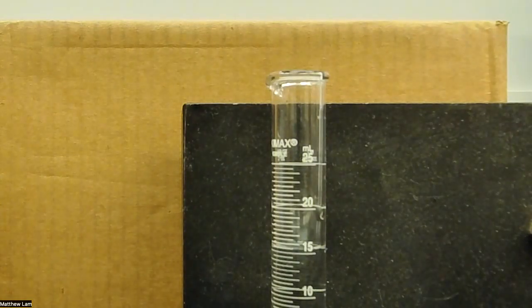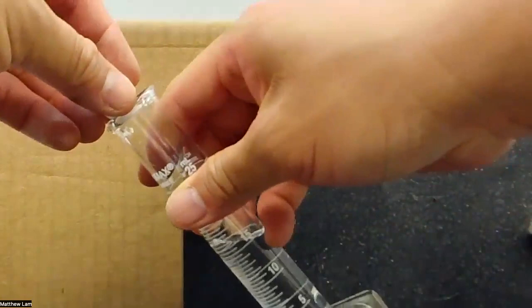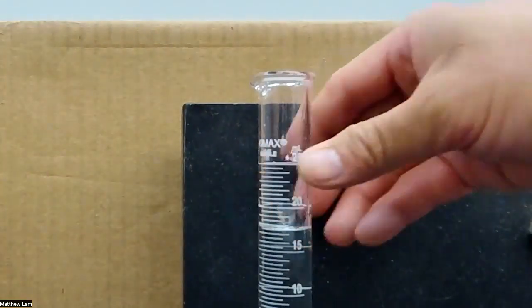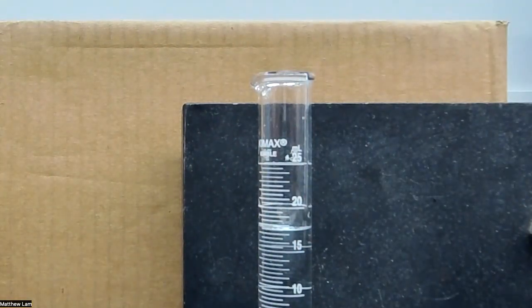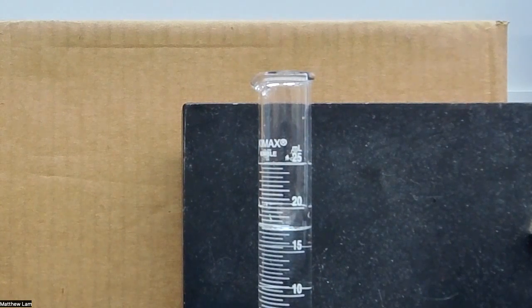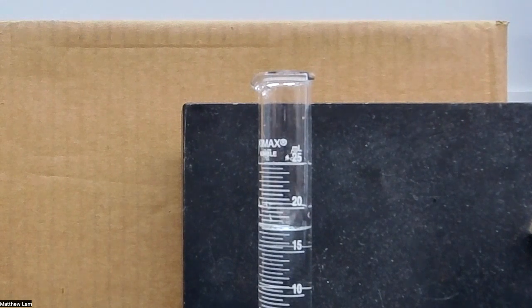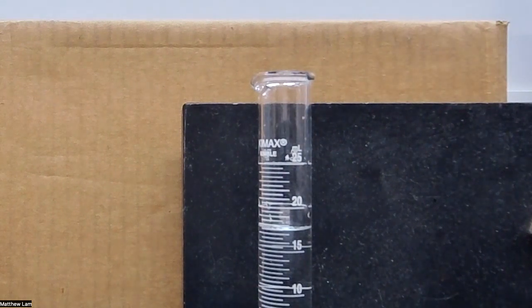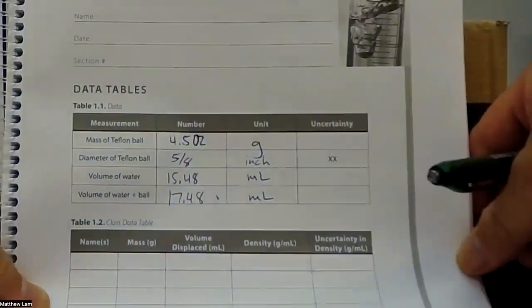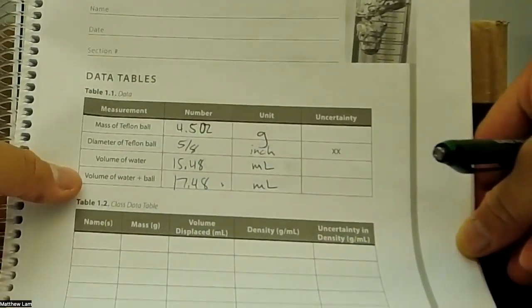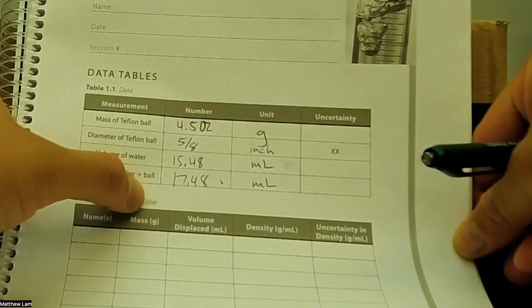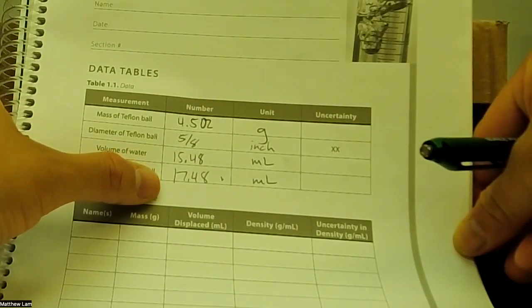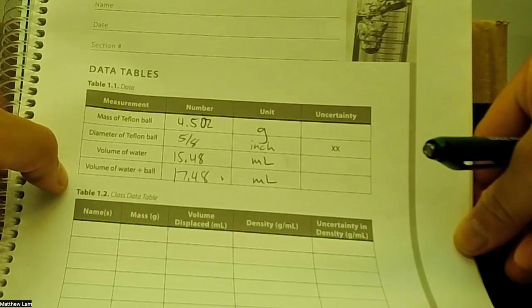And so now I'm going to add in the Teflon ball carefully. You don't want to drop it because you don't want to spill the water, and then we're going to measure it after. So it looks like after, the volume looks like it's about 16, 17, 17.48 mils. And so after I put that in, you now determine the volume of the Teflon ball with water in the graduated cylinder.